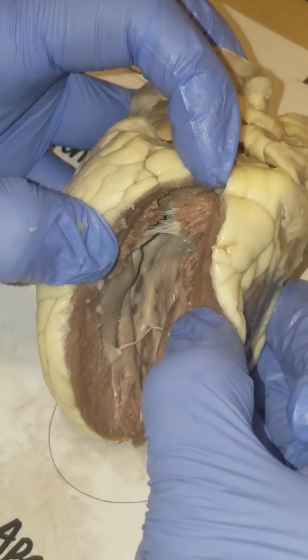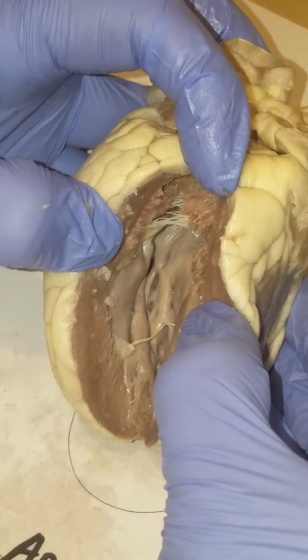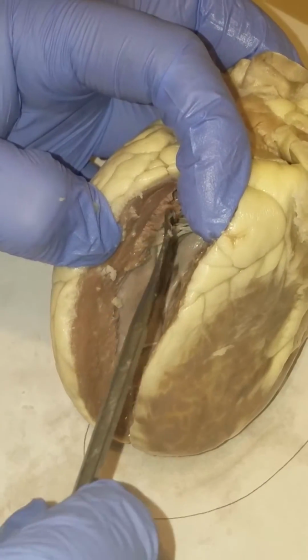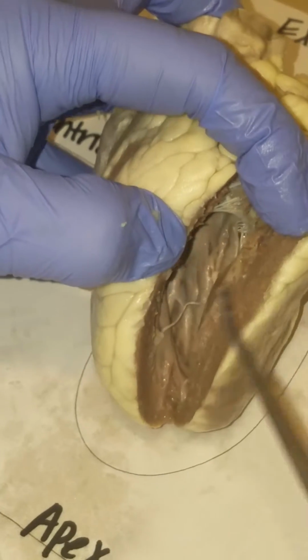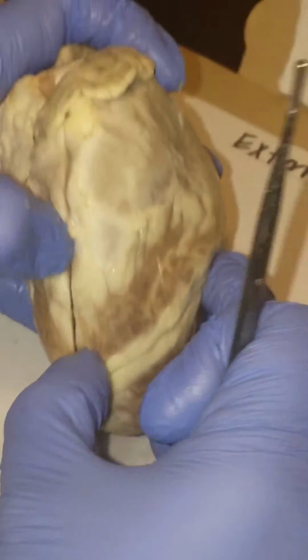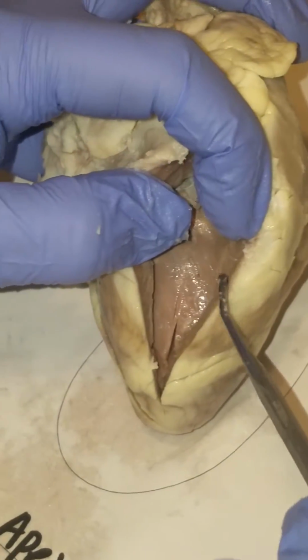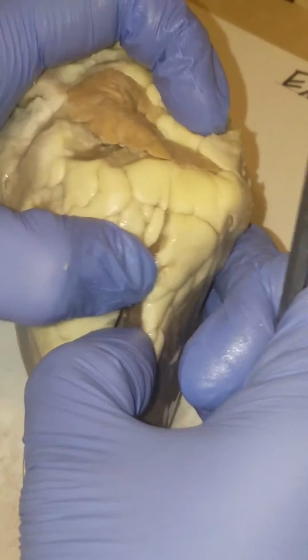Now moving to the internal anatomy of the sheep heart. You can see the pectinate muscles, which is the inner wall of the right atrium. It would be this here. The myocardium of the right and left ventricle would be, this is the right ventricle, and the left, oh, excuse me, actually this is the right ventricle, and this is the left.